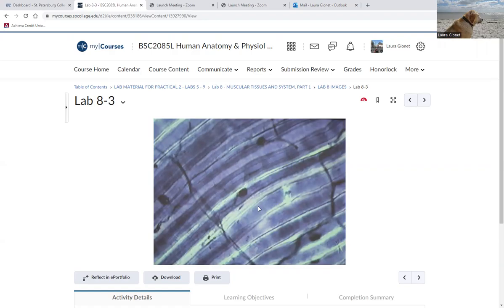And if we magnify this, and you can somewhat see them here in this little cluster, we can see some little vesicles in there. They're very dark staining. They sit on top of each other, but you can somewhat see these little balls there. Those would be the synaptic vesicles. And vesicles are these phospholipid bilayer balloons, so to speak, that store something inside. And these vesicles here store acetylcholine or some kind of neurotransmitter. But in this case, it's acetylcholine.